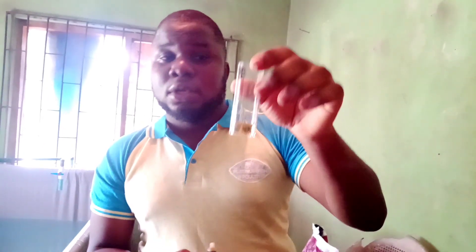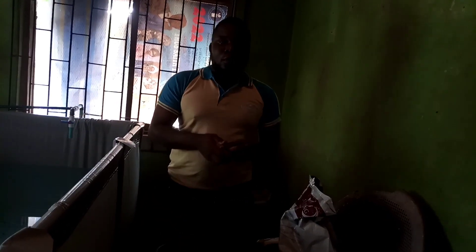This will allow us to know the pH of this water. I'll cover it and set it aside. Let's wait for 3 minutes and see — follow us.